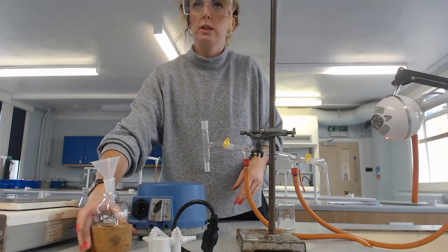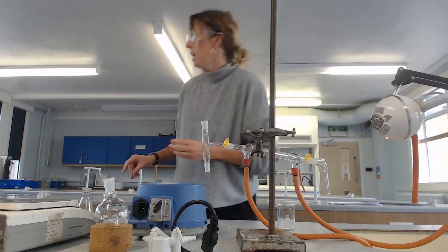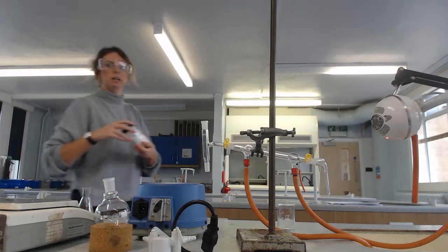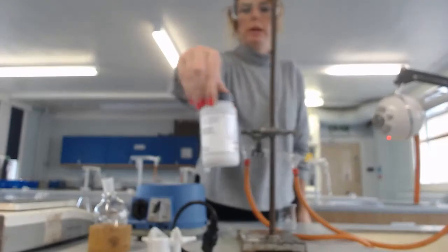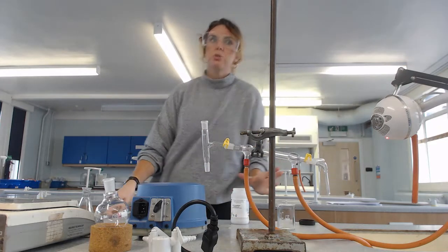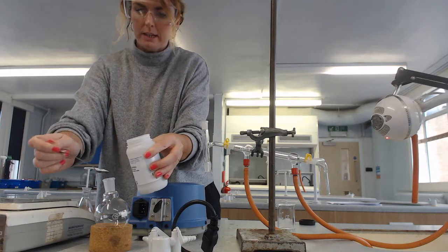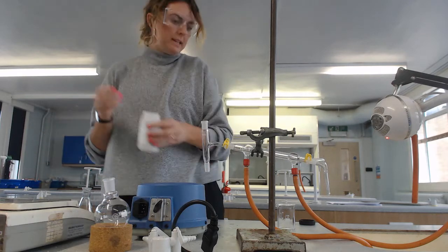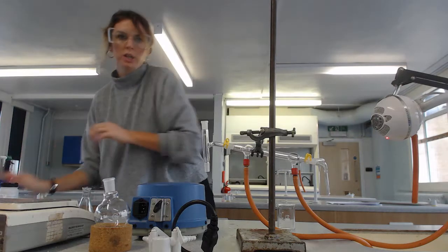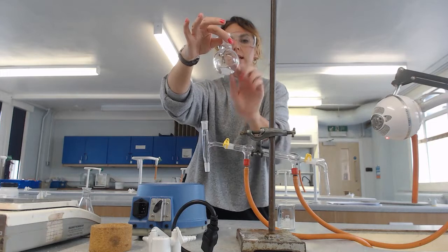I'm going to add some antibumping granules. The purpose of the antibumping granules is to ensure a smooth boil. What that means is that when we perform our distillation and when this is heated, it's not going to boil so vigorously.